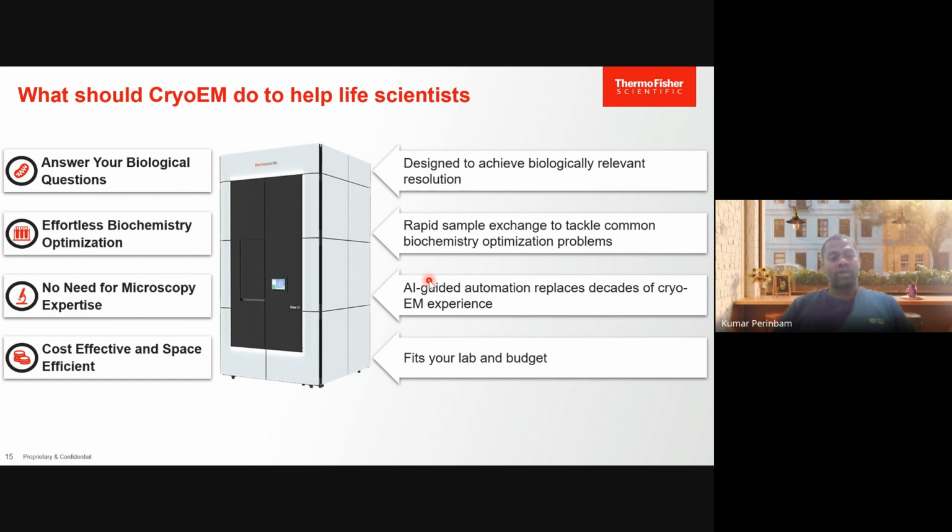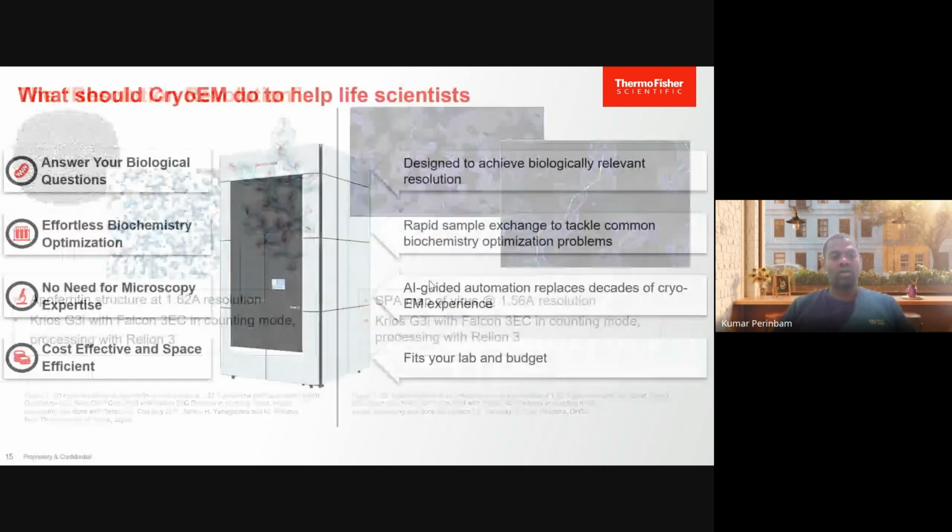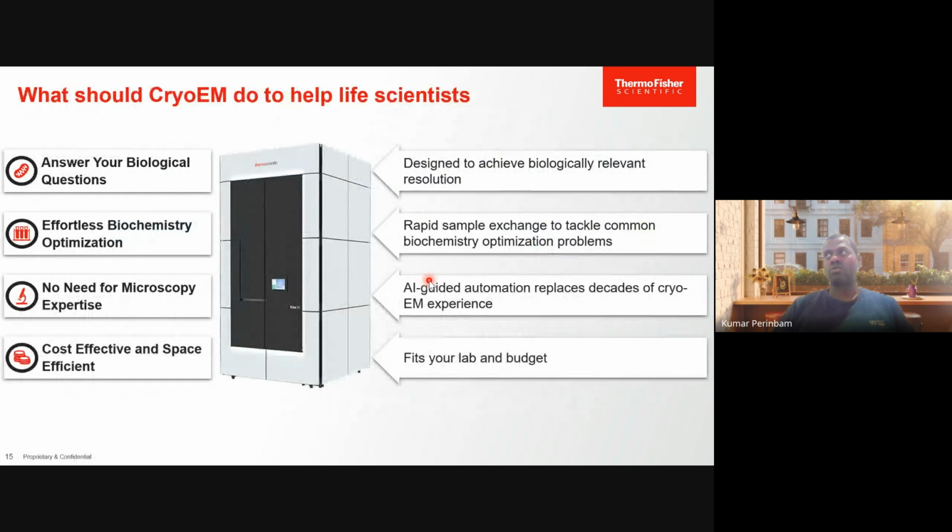And this is cost effective in some sense, although the numbers are going to be in a few crores. If you take any other structure solving tool, it's going to be a few hundred millions if you're going to solve just the structure of human proteins. And this is actually like a couple of millions, and then you will be able to solve the structure, and it's going to be pretty cheap compared to what you are going to invest in the research itself. And the output is quite dramatic, as you will see as I explain the role of cryo-electron microscope during COVID.